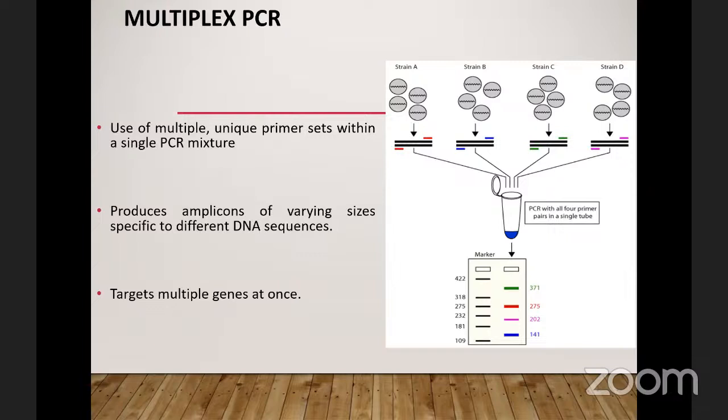I don't know if we get this. We can have a single DNA, that's DNA from a single organism, but we are interested in several targets, not just a single target.